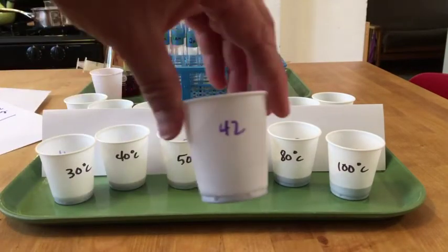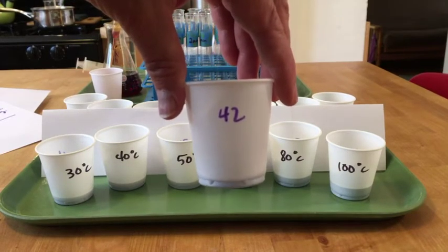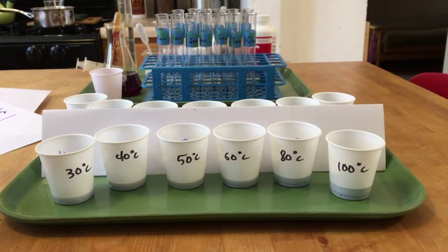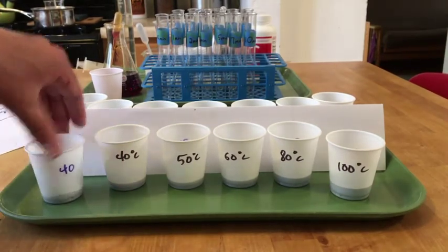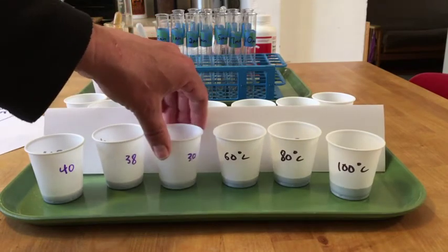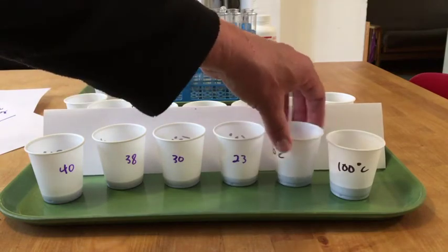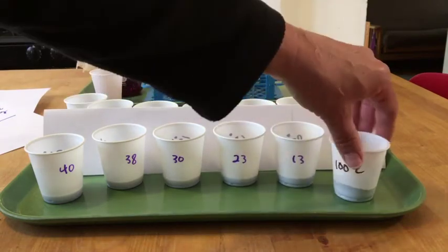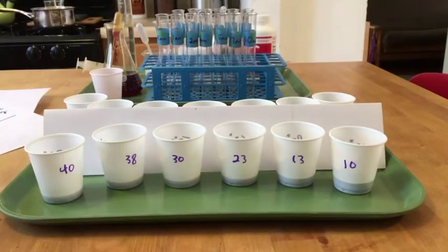So you've already seen this one, that was 42, how much vitamin C there was in the uncooked apple juice. And then for these, the higher the temperature, you'll see that the number of drops of titrant required is going down, just like with the other experiment. There's something about cooking that is causing the amount of vitamin C to decrease. You might consider that when you're thinking about the effect of cooking on the nutritional value of your food.